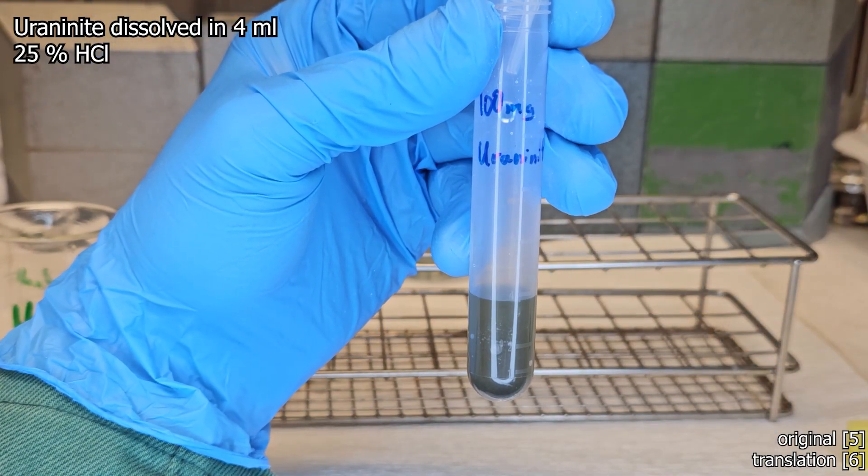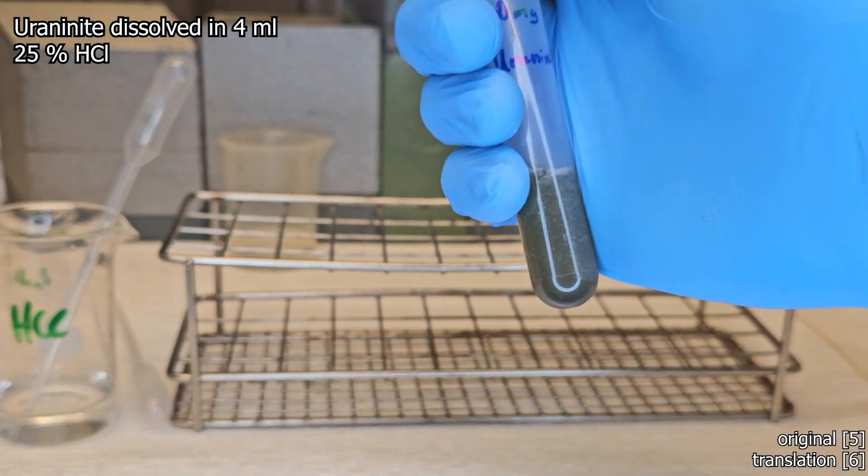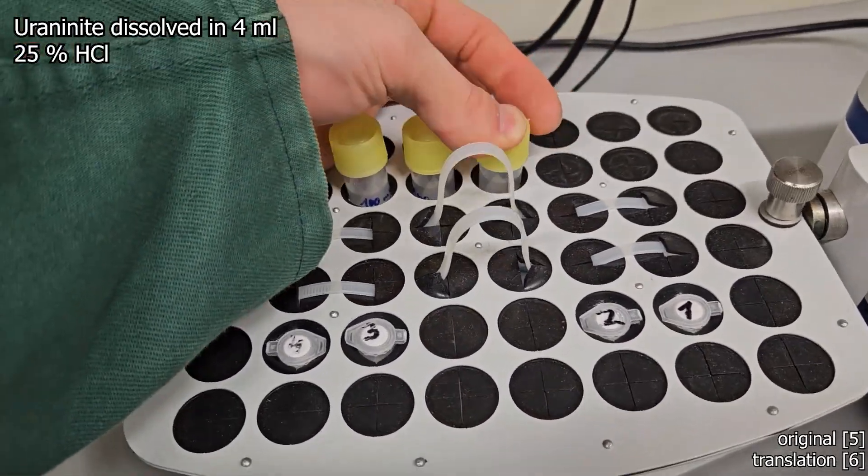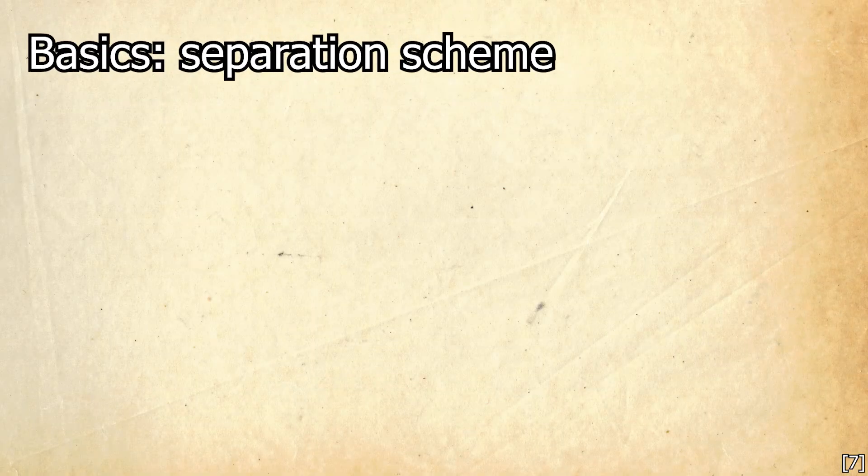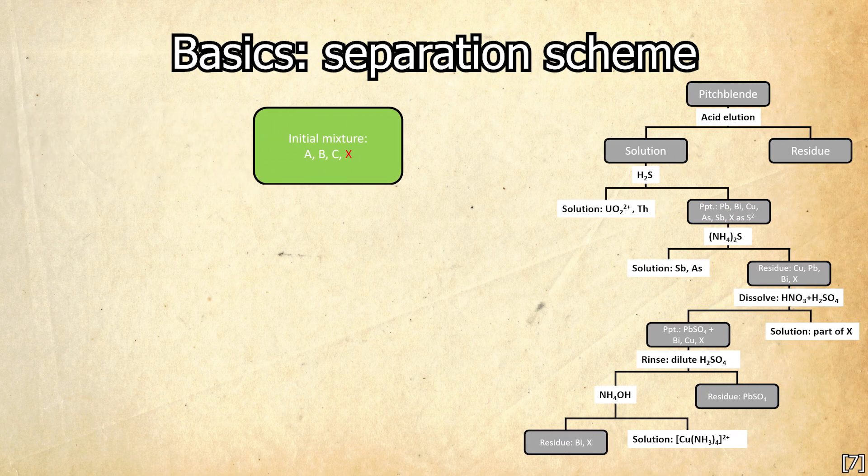We need 25% hydrochloric acid, which is added to 100 milligrams of pitchblende powder to ensure that everything soluble is actually dissolved. I added a few drops of concentrated nitric acid. The separation process I show is the classic Curie separation process for polonium.